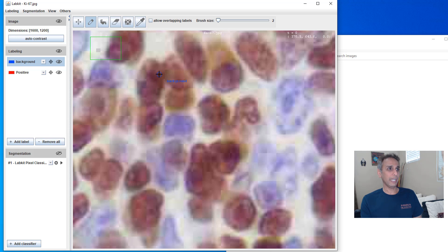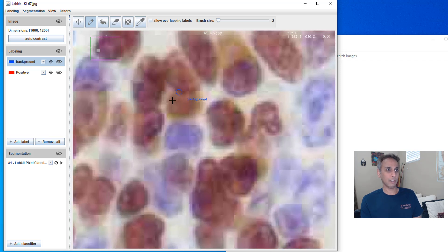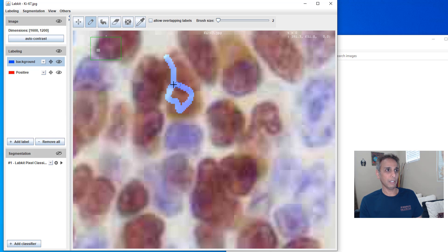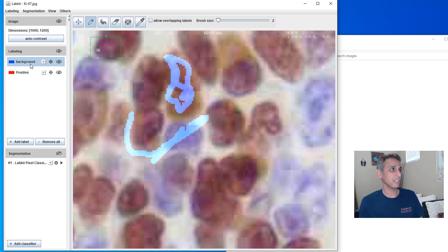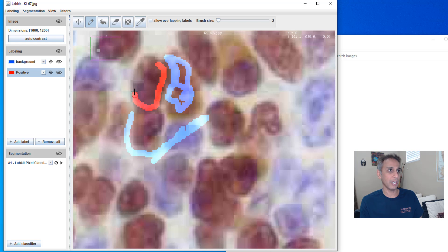But if you have like some simpler images, this may actually work much better. So let's go ahead and do one more area and then investigate this and then stop right there. So what can I do here? So this is when I have to decide whether this is a nuclei or not.